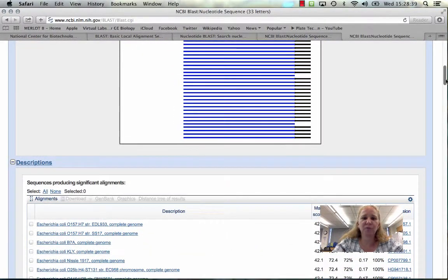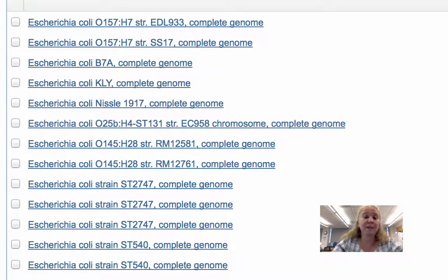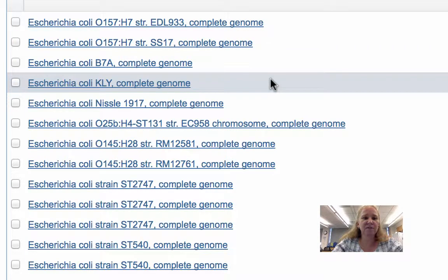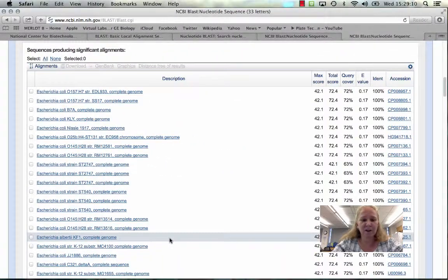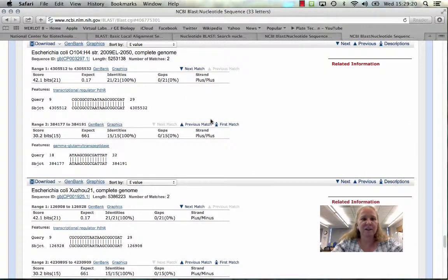If we had a really close match, we'd want there to be more matching parts of the sequence. As we scroll down, there's a table showing what those sequences are from — what sequences in the database happened to match the sequence we entered. We can see that most of the top hits here are gene regions in Escherichia coli. That's actually the bacterial cell that our nematode worms eat. Continuing down, there are other bacteria as well. If we wanted to learn more about those genes, we could click on any of these to get more information. I'll leave this for you to explore in lab as you search for genes in our worms that are similar to genes in humans.